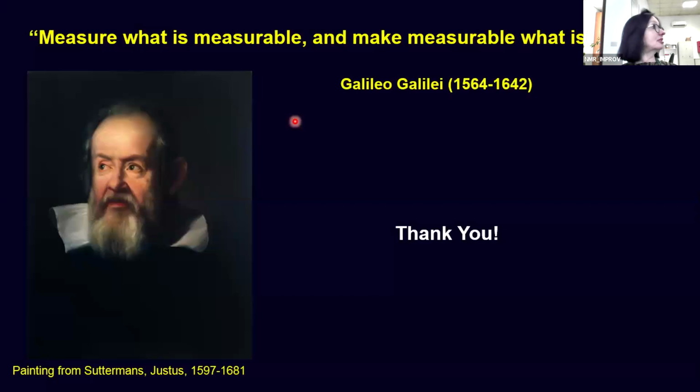And if I perform, for instance, an NMR relaxometry experiment on ionic liquids in, I don't know, a kind of ionogel, I do not want just to get the diffusion coefficient, because after all, I could use field gradient. What I want is, for instance, to confirm or disprove that the geometry of the gel provides a kind of geometrical restriction for the diffusion.